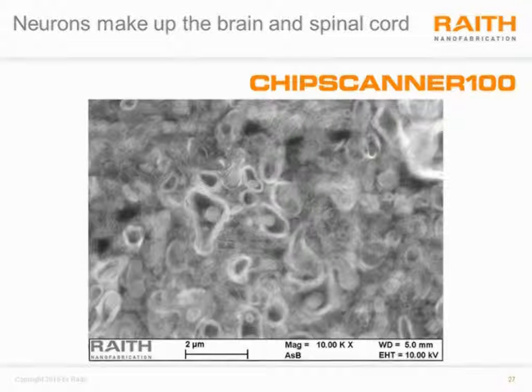And here we have an image of neuronal tissue that has been stained with osmium tetroxide and also uranyl acetate in order to produce very good contrast for the myelinated walls here, as well as the neuronal cell ultrastructure, which can be clearly resolved at very high resolution with this scanning electron microscope.